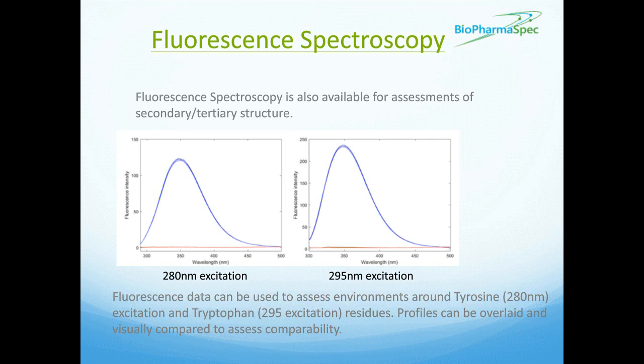As I said, it's been quite superseded these days with techniques like CD and FTIR, but due to the sensitivity of the method, I think it's something that people still do and expect. And again, I would suggest that it's something that we do at the start of the analysis, and it's then to be considered if it can be dropped at a later date.